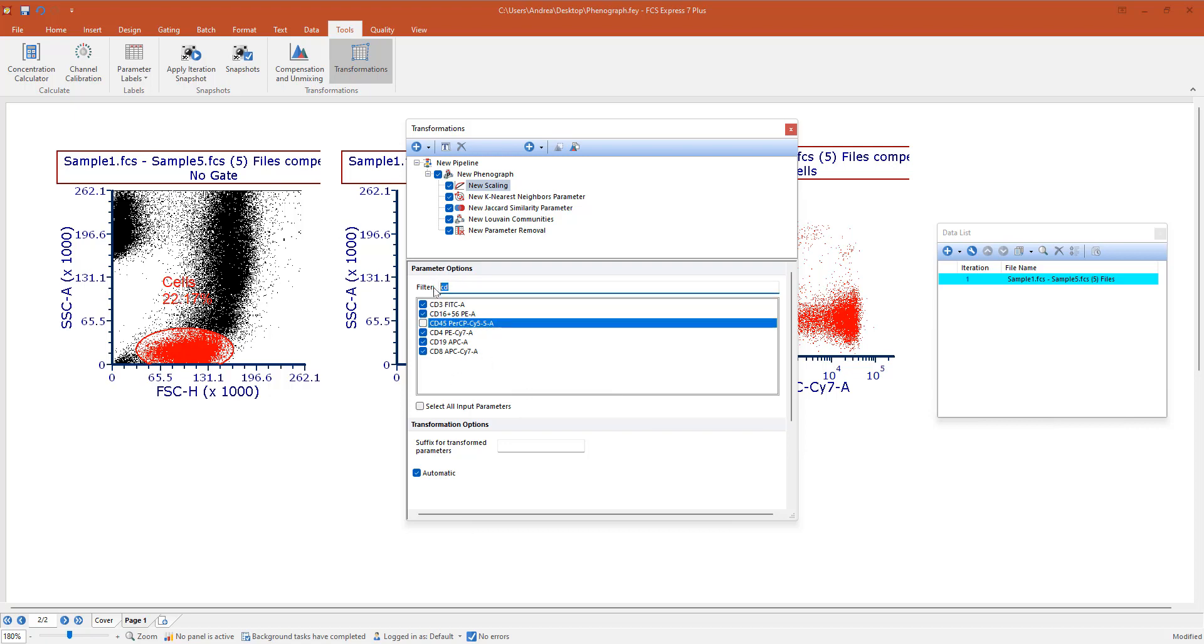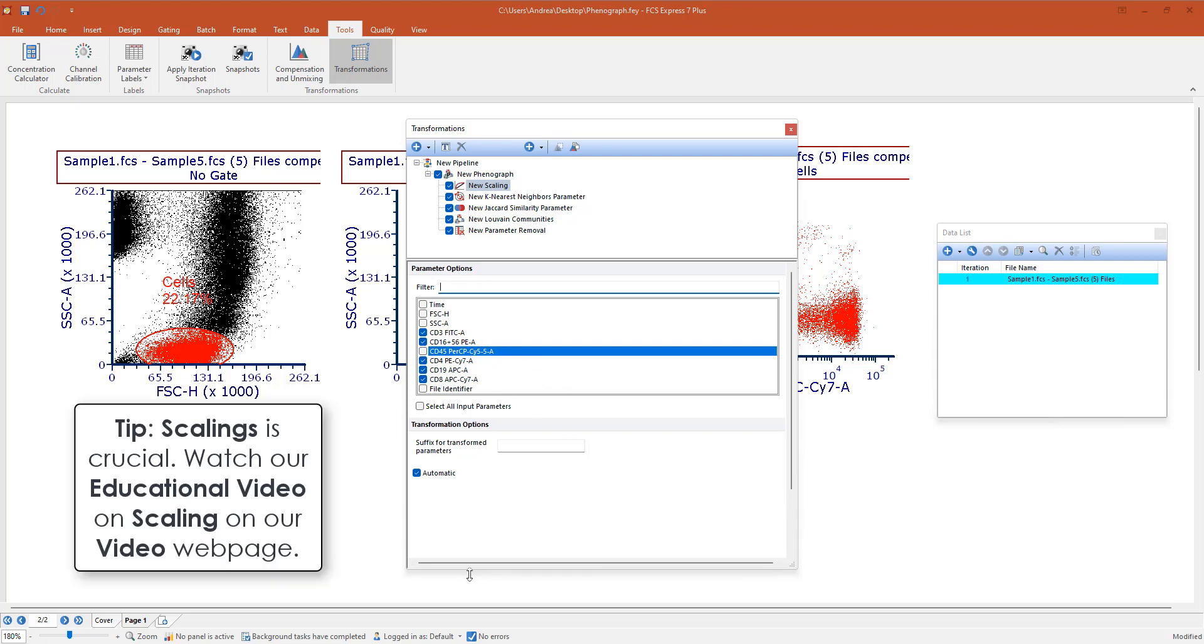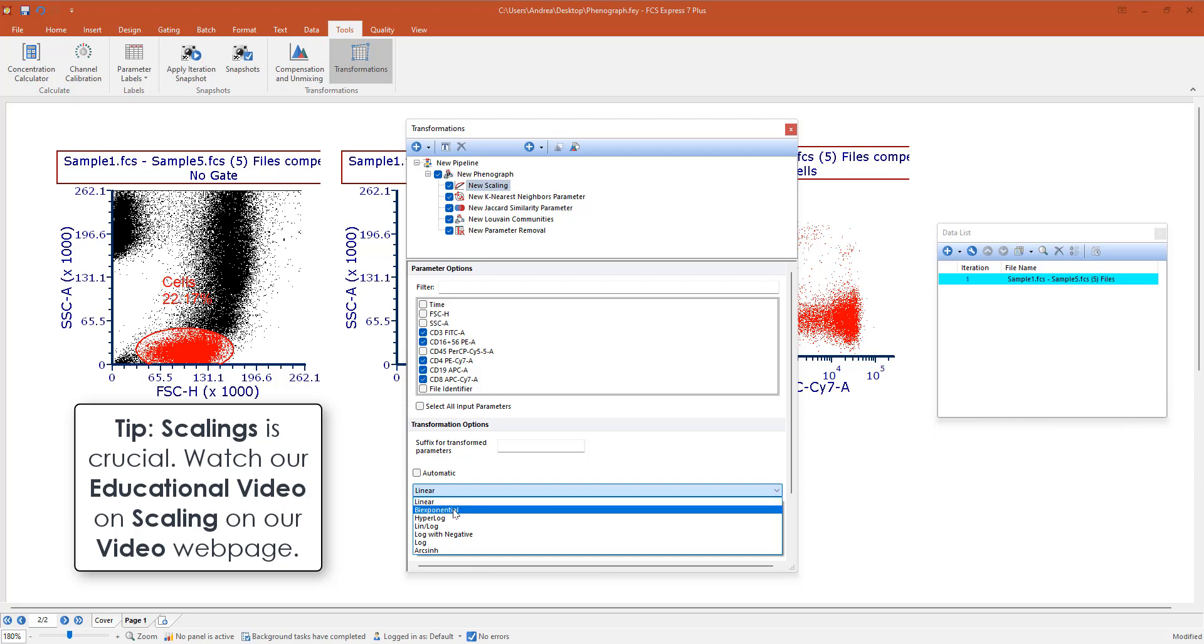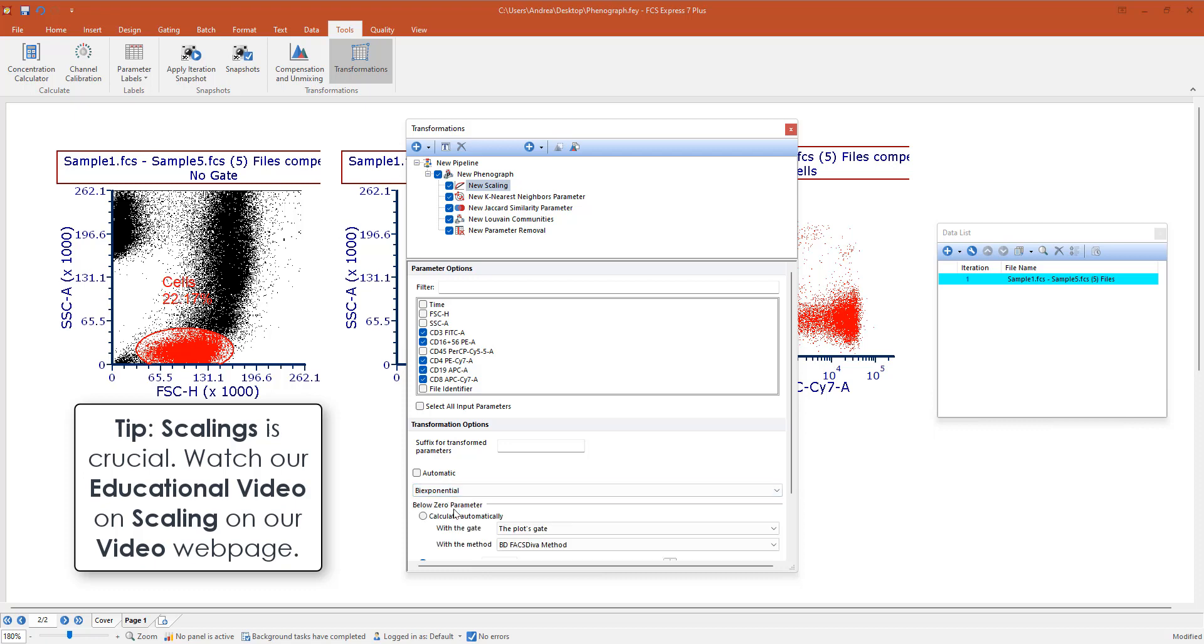If you remove the tag here, you will still see the entire list. We're going to scale the selected parameters with a specific scale, so feel free to explore your data and find out the best scale for them. In this case I'm going to select the biexponential scale with the automatic calculation of the below zero parameter.